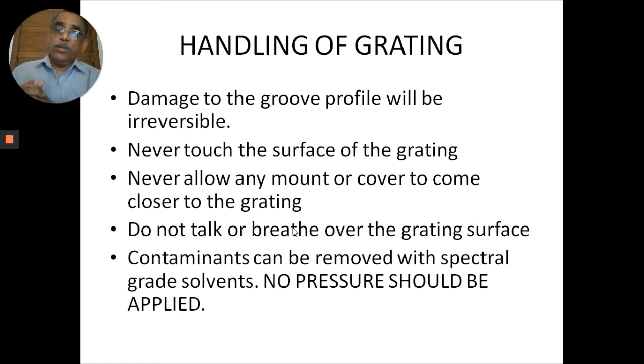And if there are some contaminants on the surface of the grating, you can also remove them, but you must use the right spectral grade organic solvent. You should not apply any physical pressure on this. With normal lens cleaning tissue, you should put a drop of the solvent which can remove it.